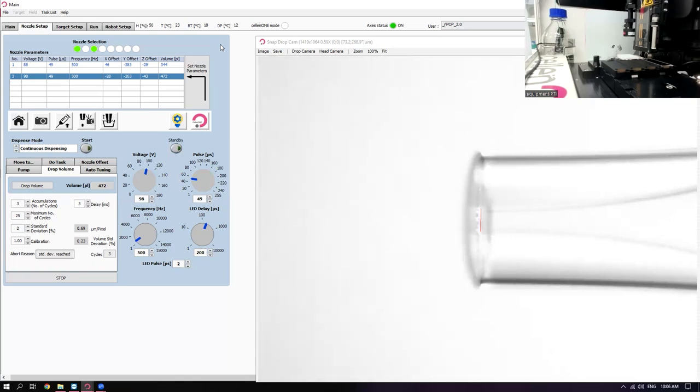You can also do a lot of other tagging or look for GFP-positive cells, so there are various uses to that. You also get images of the cells with parameters relating to their morphology, and all of that allows you to do more correlative analysis downstream.